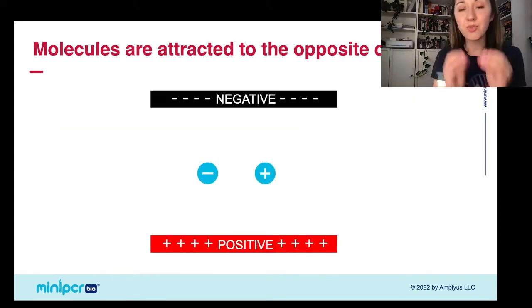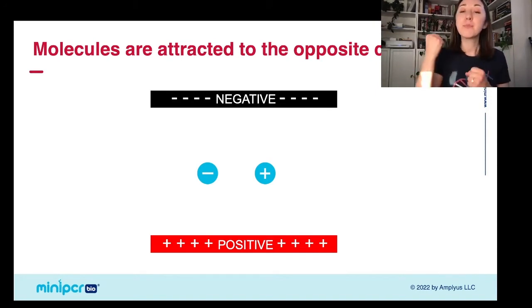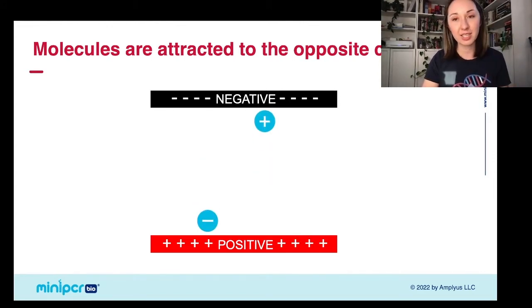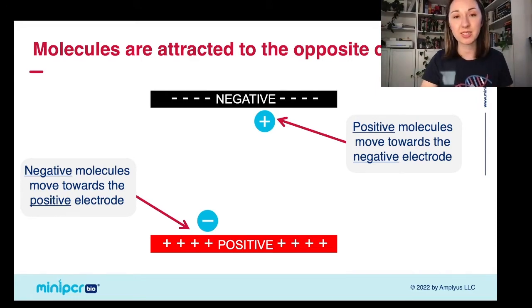So as you create this electric field in your gel electrophoresis setup, molecules that have a charge are going to be attracted to the opposite charge in that gel. So if you have positive and negative molecules in your gel, the positive molecules are going to be pulled towards the negative electrode, and the negatively charged molecules are going to be pulled towards the positive electrode. So by looking at which direction the molecules migrate, you're going to be able to tell what their overall charge was. So again, positive will move towards negative, and negative will move towards positive.